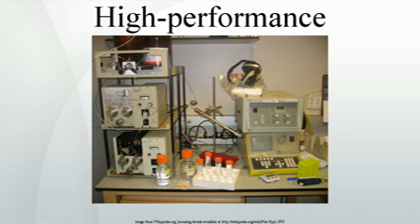Pump pressure. Pumps vary in pressure capacity, but their performance is measured on their ability to yield a consistent and reproducible flow rate. Pressure may reach as high as 6,000 pounds-force per inch squared, or about 400 atmospheres. Modern HPLC systems have been improved to work at much higher pressures, and therefore are able to use much smaller particle sizes in the columns, less than 2 micrometers.